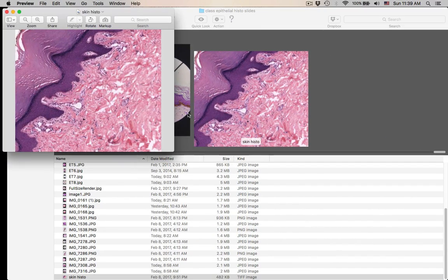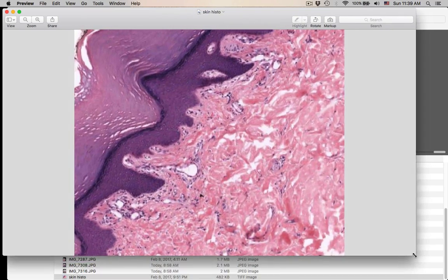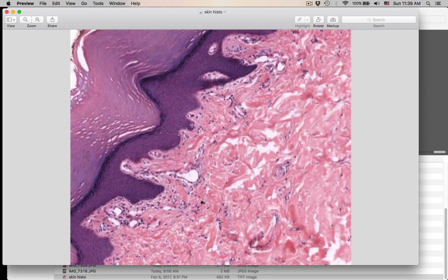And our last slide, this one does not want to come out. Our last slide here, this is going to be number 32. I just want you to tell me the name. You should know where you are. The name of this darkly stained area right in through here. What layer is this where you have this darkly stained area?